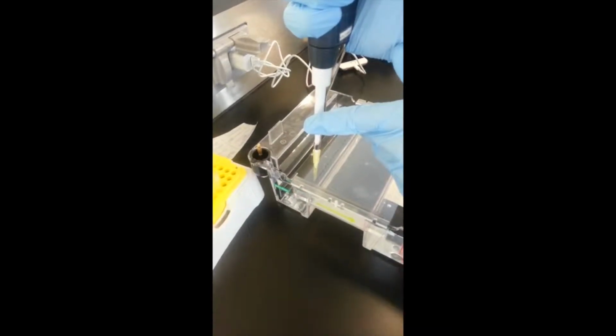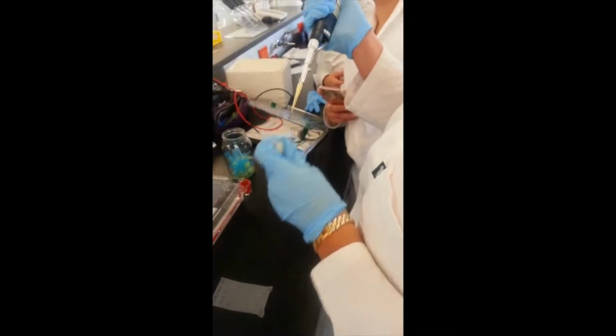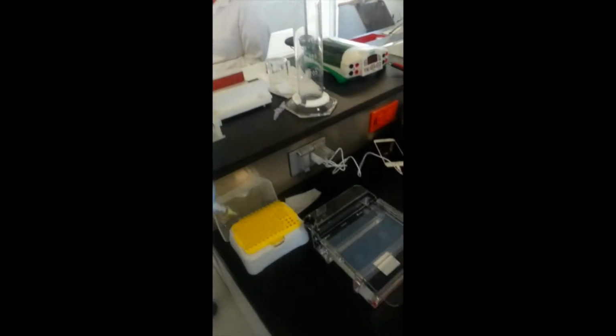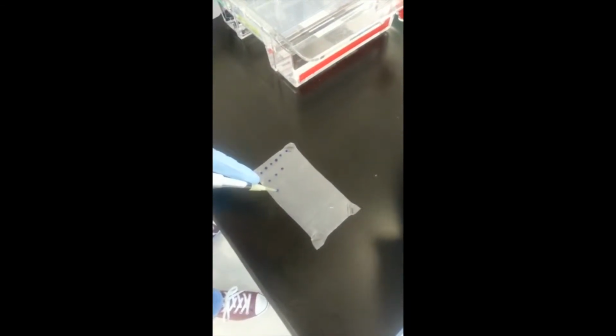If the samples of DNA or RNA don't have a trustworthy pureness, then the results in the different reactions such as PCR, enzyme restriction, and sequencing will be affected by all the contamination, avoiding clear results for a reading. If you have a low quantity of products because of a bad treatment of samples, you won't be able to do any reaction because there won't be enough DNA or RNA.